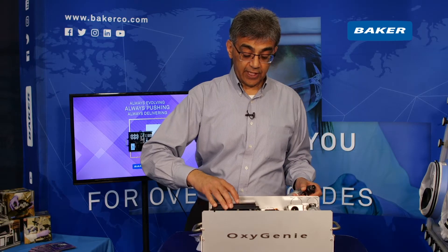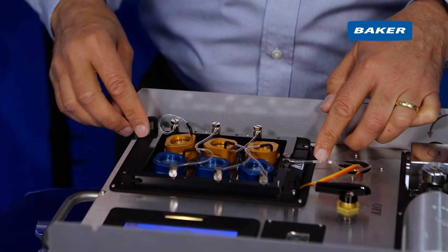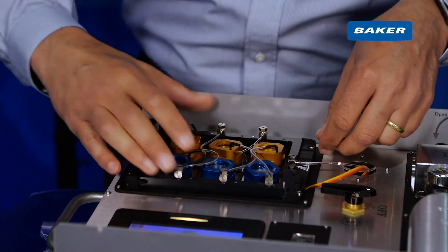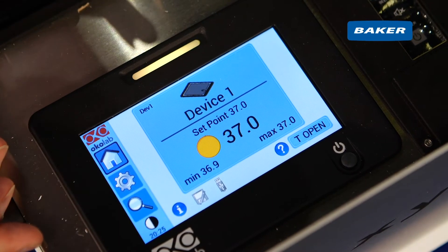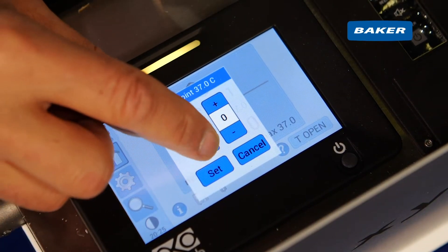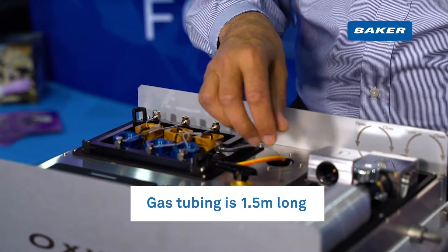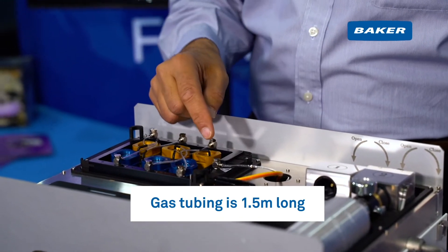Secondly, if I take off the light protective cover, you can see here there's a heated plate and a sample cup holder that holds up to six different sample cups. We call these one wells. Thirdly, there's a touch screen where you can set the temperature and also do some diagnostics and run your audit. Fourthly and lastly, you have a gas tubing system that runs from the gas cylinders into each of the one well sample cups.